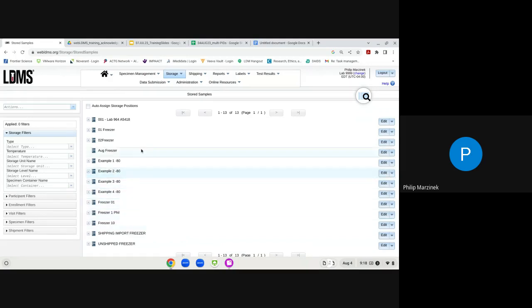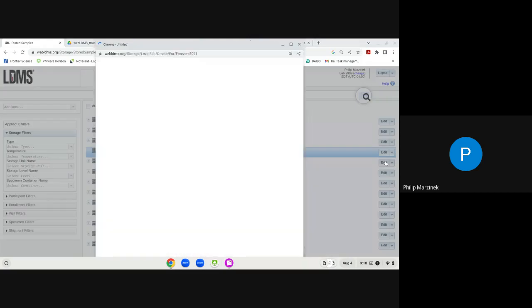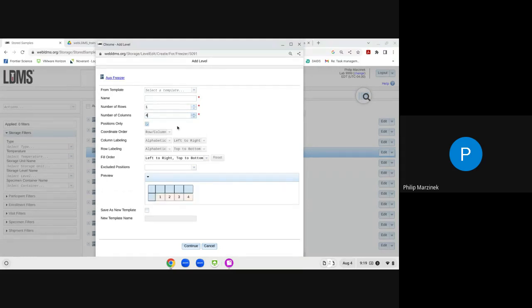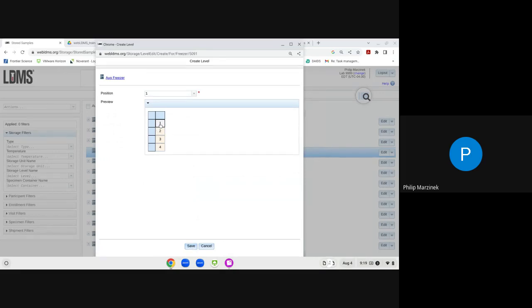Next, add the shelf configuration by clicking the edit drop-down and selecting Add New Level. Use a template or create a new configuration — in this case a one-by-four configuration giving four individual positions within the shelf, each holding a five-by-five stainless steel rack. Name it Shelf One, click Continue, then designate where the shelf goes in the 2D freezer structure by selecting position one and clicking Save.